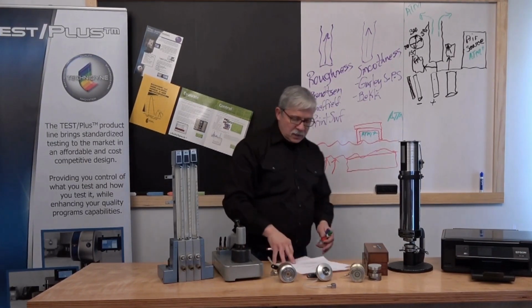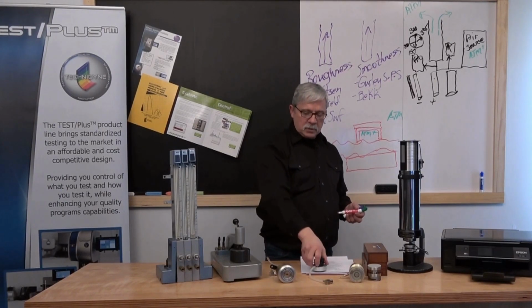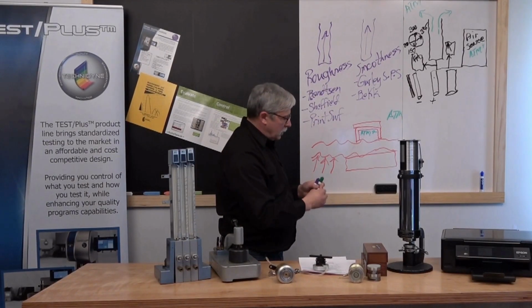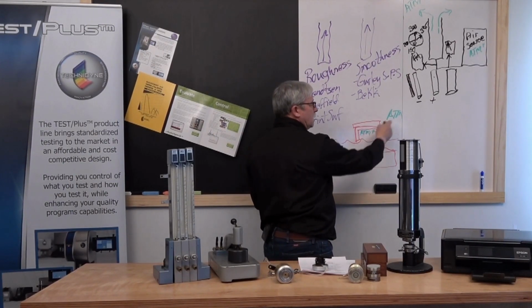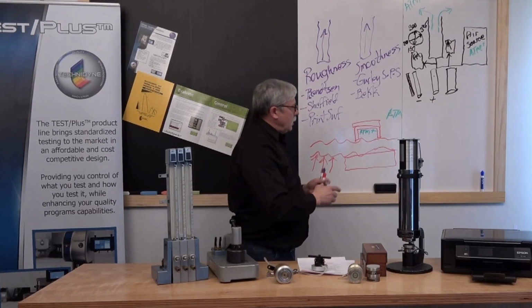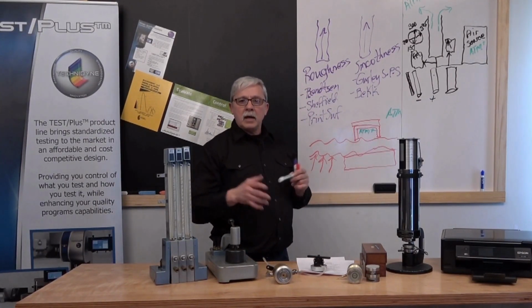Now we have more or less a table. Put our sample on, turn the measurement head up on. Now we have a pocket underneath this measurement head, in between this annular ring that we've captured. Again, we can create a pressure drop between the area underneath the measurement head and atmosphere. So if we set this device on top of our product, we crank up our air source so that we have some pressure underneath this area that's higher than atmosphere.